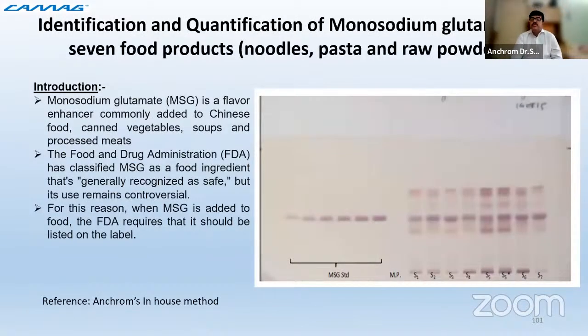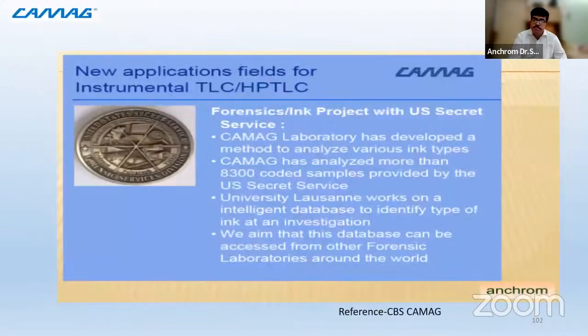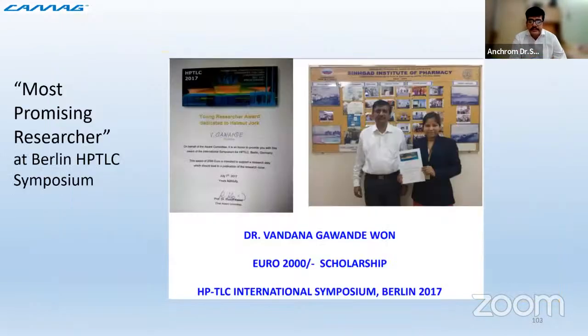Preservatives, sample preservatives, you also use SMP and SPP, sodium methyl paraben and sodium propyl paraben as preservatives in many of the formulations, and that is it.